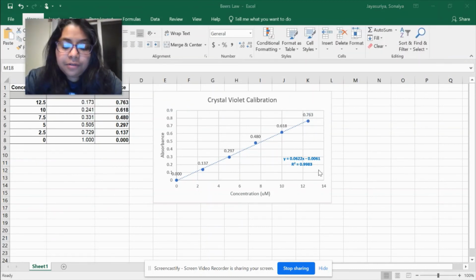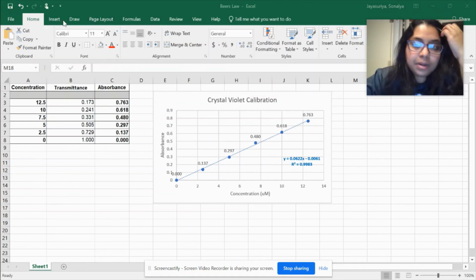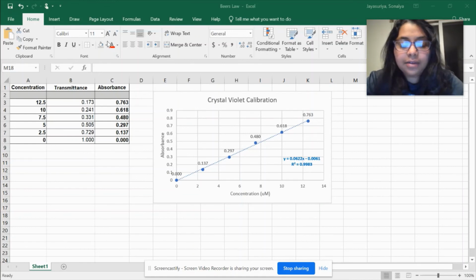So the equation for this line, I also made Excel give me a trend line that's a best fit line. You can do this in Google Sheets. I'm not exactly sure how, but I think you can easily look that up. It's not that hard to look up how to insert a trend line, okay? They may have changed it slightly. I'm good with Excel, I just forget the similar functions in Google Sheets, okay?